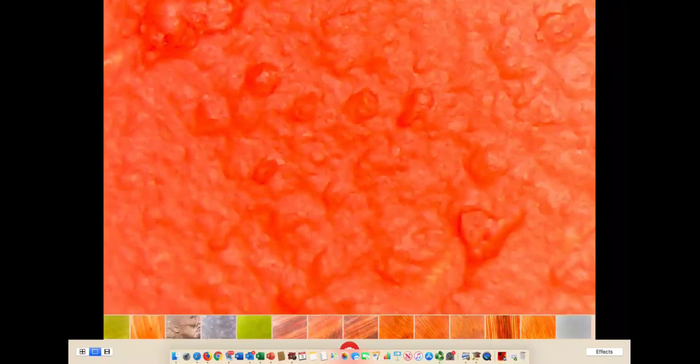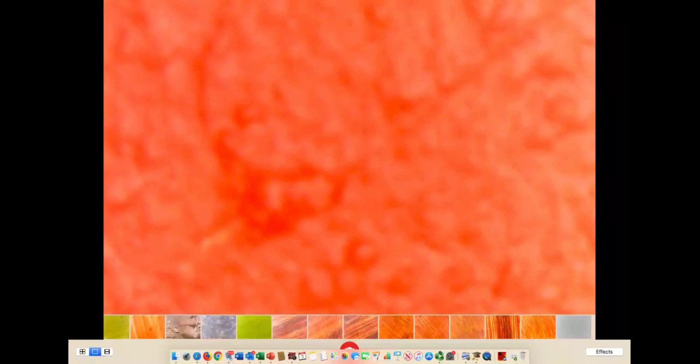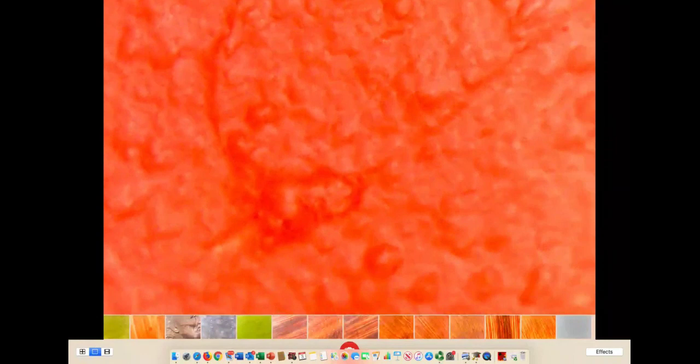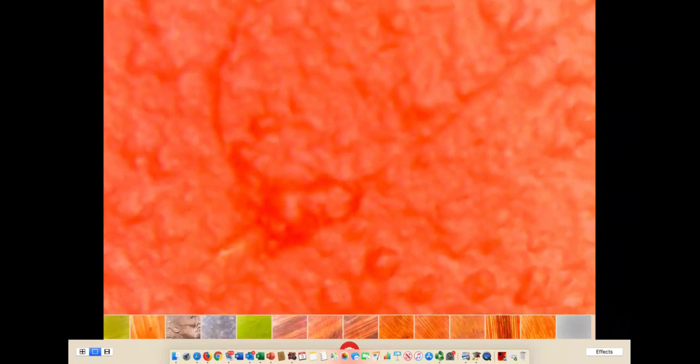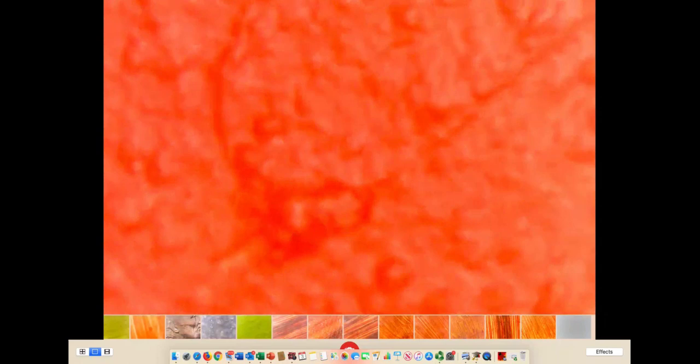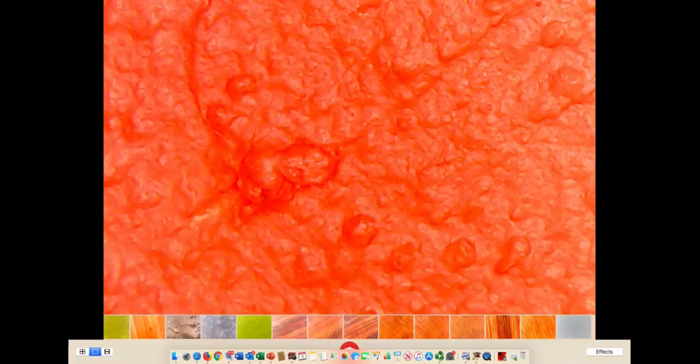I'll adjust this on the fly. This will give you an idea of the capabilities. I'm moving the microscope, but I would have to put more time into focus. You can see particles and imperfections, and it depends on the brush as well.